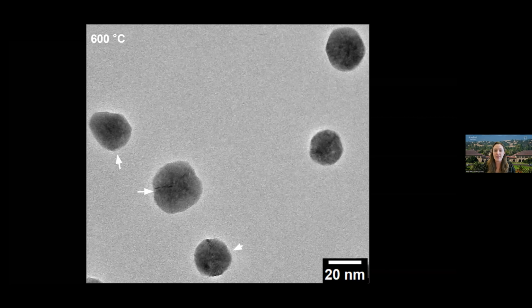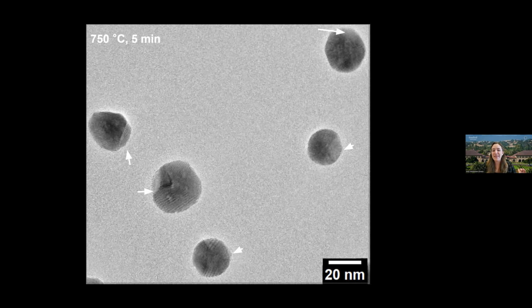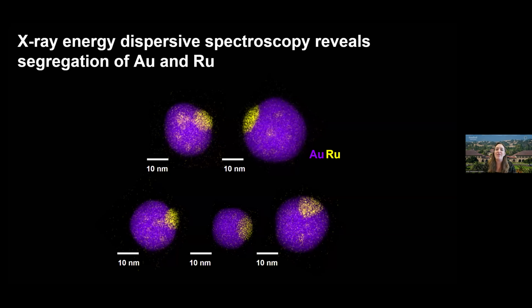As we increase the temperature, we see that the particles remain pretty much unchanged until we get to temperatures around 600 degrees C, where we see the formation of a light contrast region. We were a little bit like, are the particles melting? What is happening here? Zooming in on some lattice, we can see that these different contrast regions are definitely within the particle. They're not growths on top.